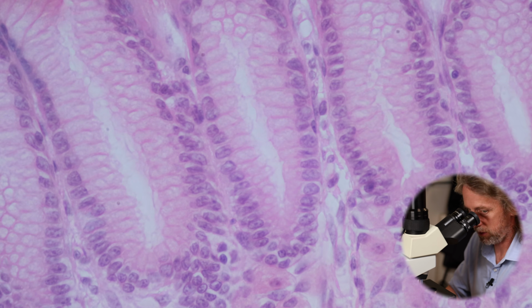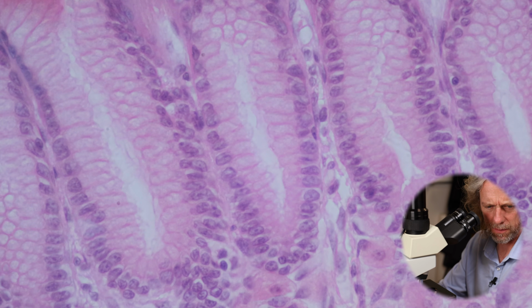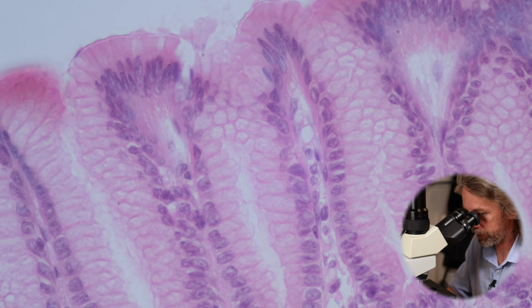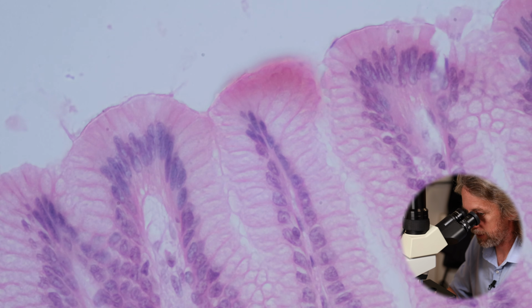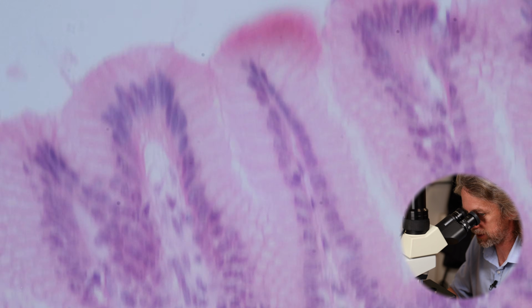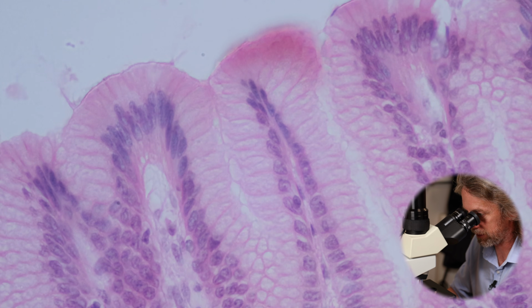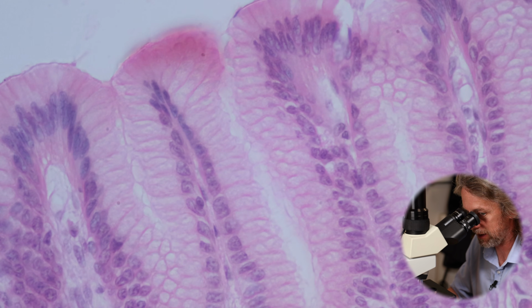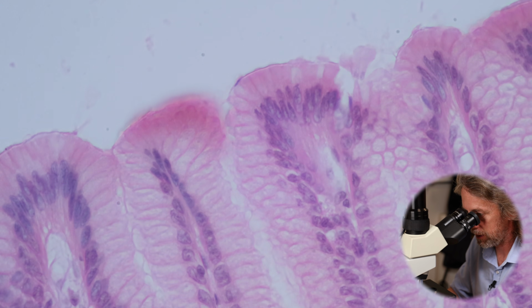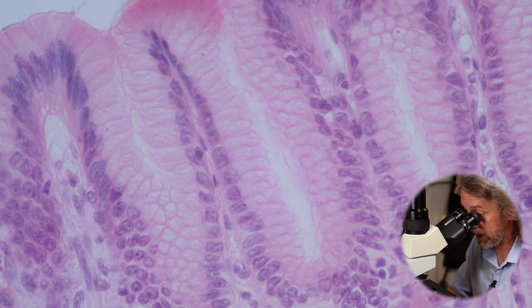Now, it's not terribly stained. It could have a bit more stain on this one, but all right. So there's the lumen where the food is, there's the surface, and there are some nice examples there of gastric pits. I think you can see the shape that I'm trying to describe. And you can see those cells there.